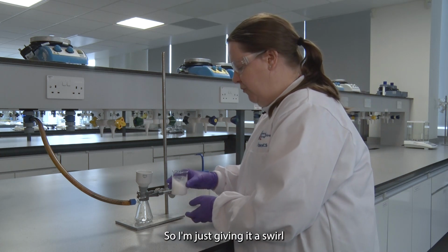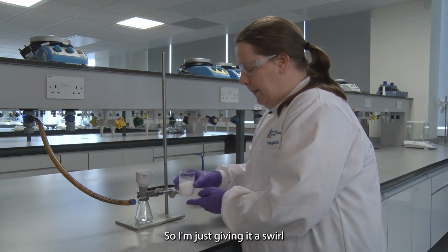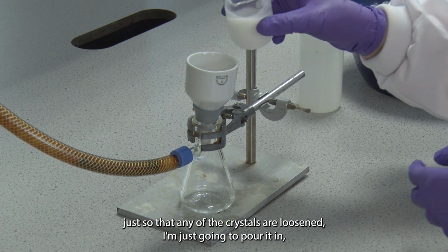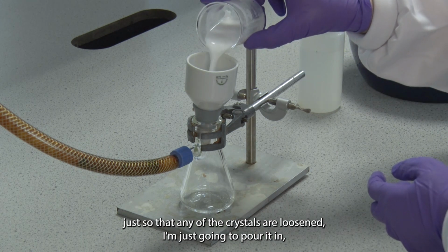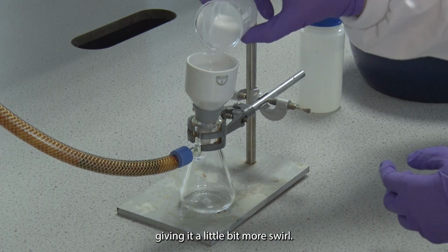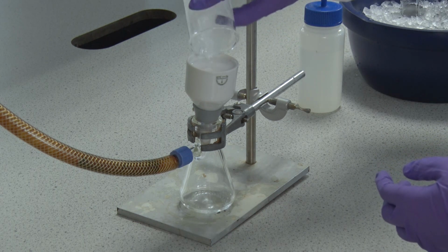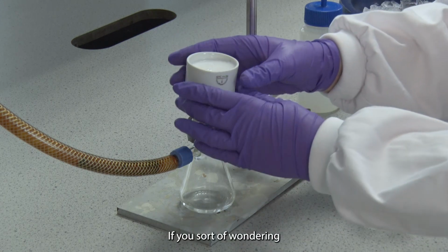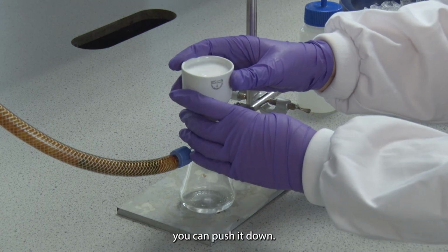So I'm just giving it a swirl just so that any of the crystals are loosened, and I'm just going to pour it in, giving it a little bit more of a swirl and pour it on. If you're wondering, you can push it down.